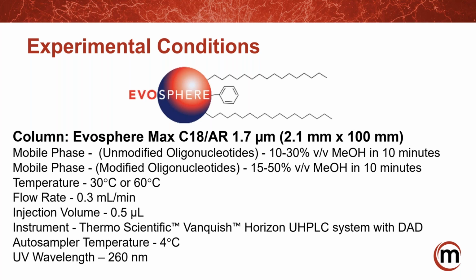Okay, great. Thank you so much. I'm just curious. Because this work is without the ion pair, have you ever tried the ion pair mobile phase with the C18AR column? There have been some studies done by Eli Lilly where they looked at different kinds of ion pairs and how they interact with bonded phases.